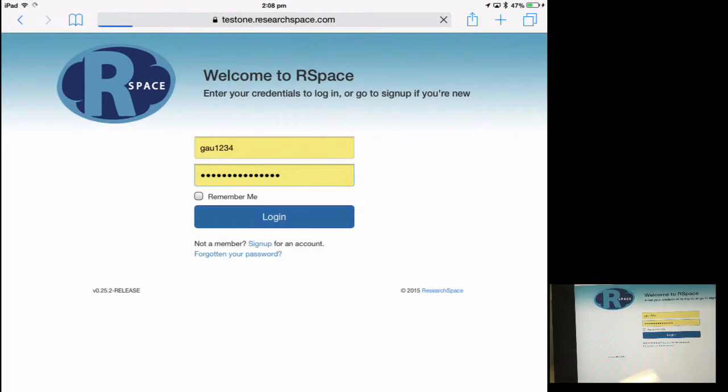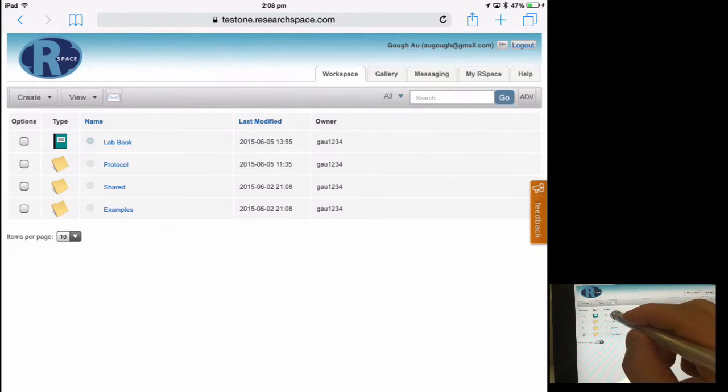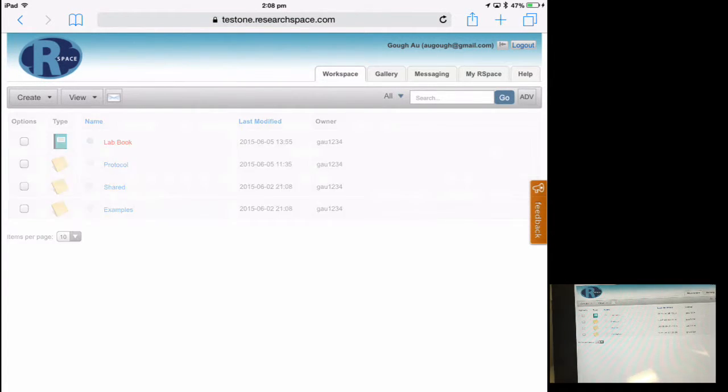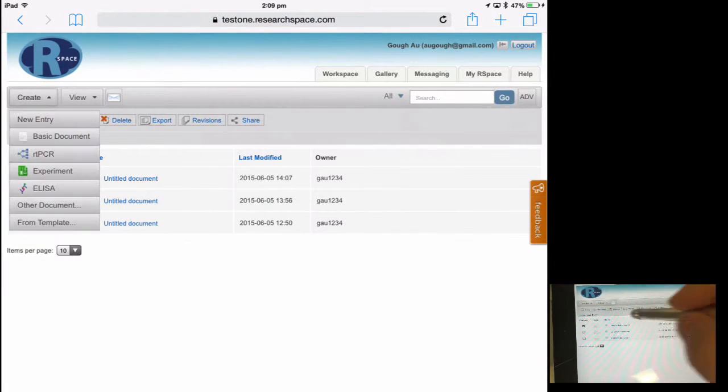Because RSpace runs through a web browser, it's fully compatible with mobile devices. In this instance we're running RSpace through Safari on an iPad.